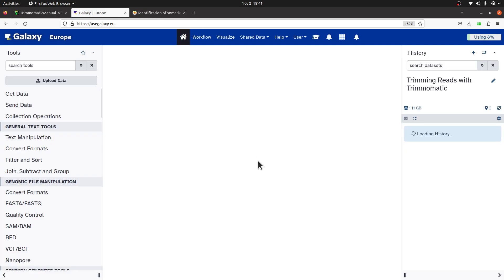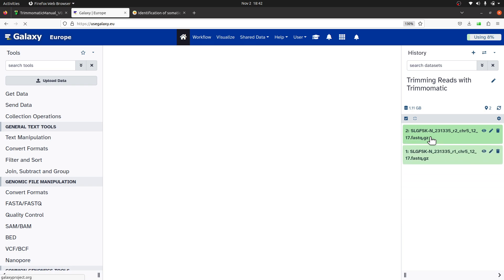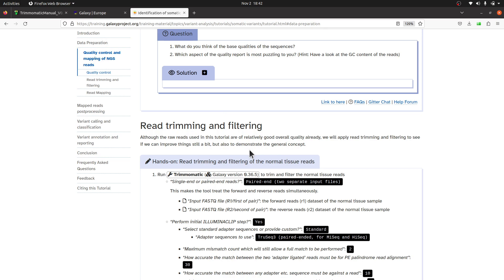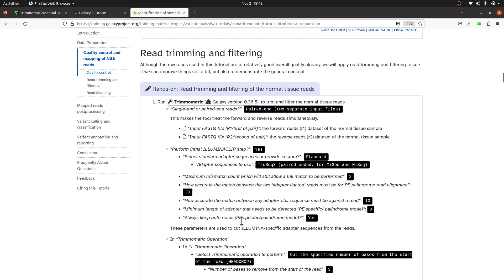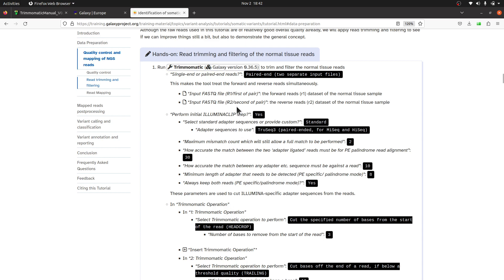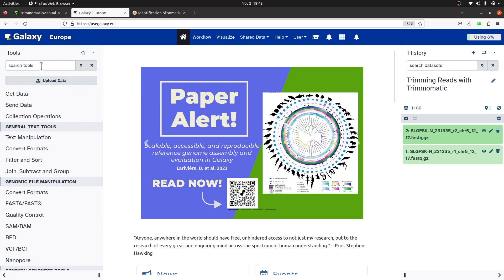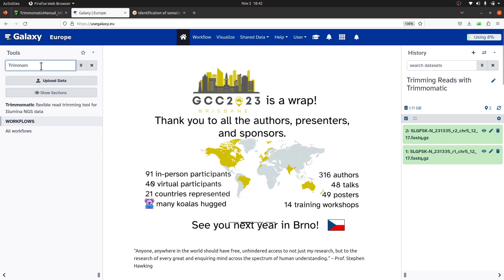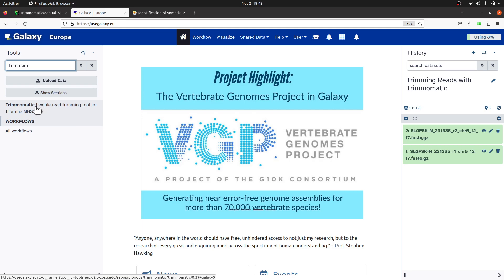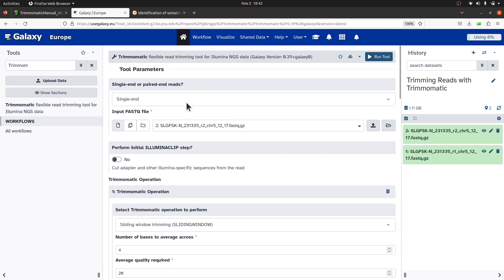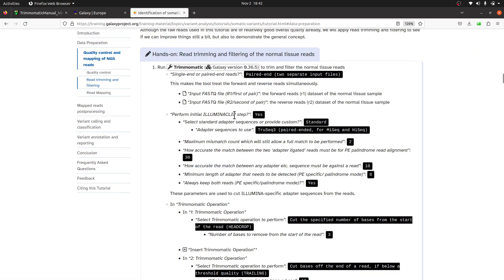Everything looks fine, so I'll move straight to the activity — performing the trimming. We will use Trimmomatic. On the Galaxy platform, come to the Tools panel and search for Trimmomatic. Once you start typing it will show for you. Select it, and you will have some options. Let's look at them one by one. Here it says single-end or paired-end — we select paired-end because we are using paired-end reads.